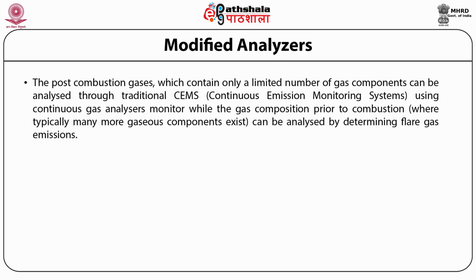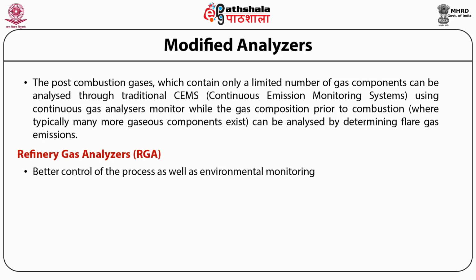This can be achieved by gas chromatographs, which are capable of multi-component analysis, including calculation of the calorific value in a refinery. A gas chromatograph monitors the impurities in the hydrogen recycle stream and improves the product quality by minimizing the C3 and lighter content in the finished product.